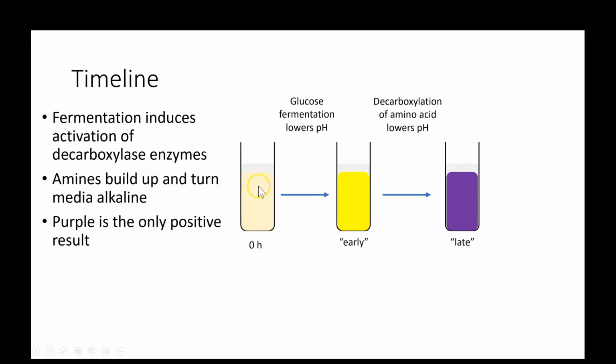It's kind of like this olive-like color, or a yellow color. Those are both negative. They're both considered negative for decarboxylation. The only positive result that we have is purple.